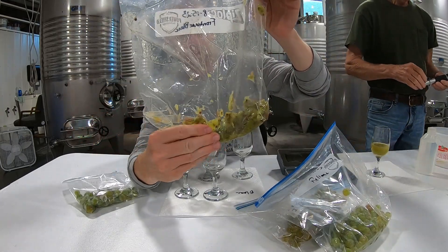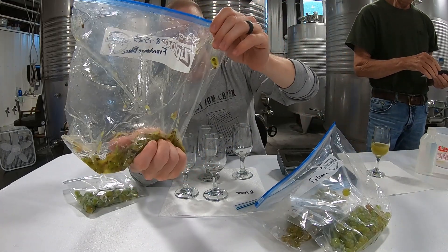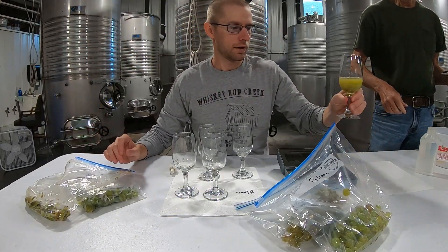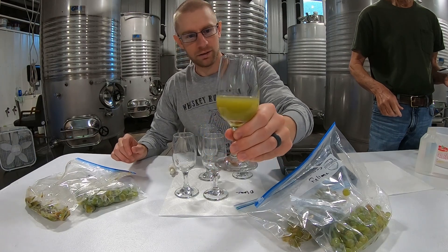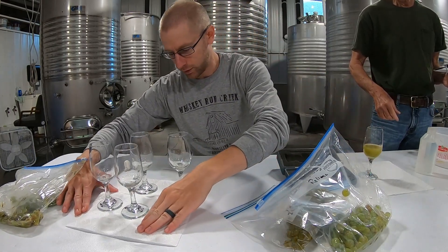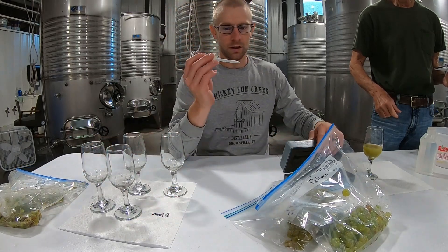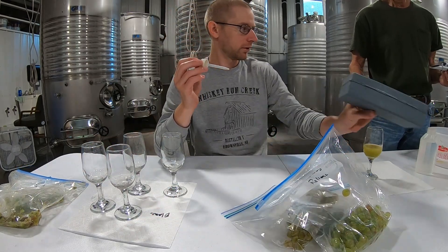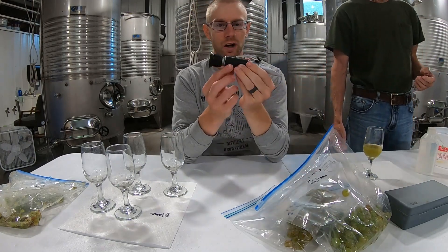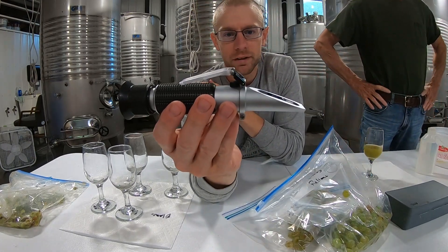What we'll do is smash up all the grapes inside the bag to juice them out, and then once you do that you pour it into the glass. Then you take your eyedropper and your refractometer, which is what reads the sugar content.